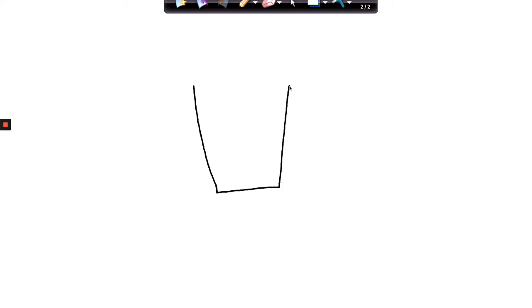Then we are not going to draw the nested things, but we understand that it's a styrofoam cup inside a foam thing. Then, guys, we're going to put a lid on this. In lab, your lid will actually be a piece of cardboard. It doesn't seal tight. It works just fine. Then, guys, you're going to put a hole in your calorimeter.